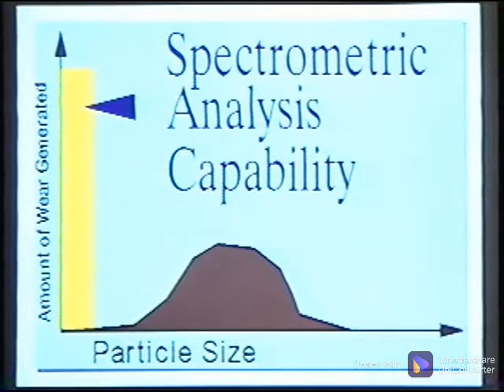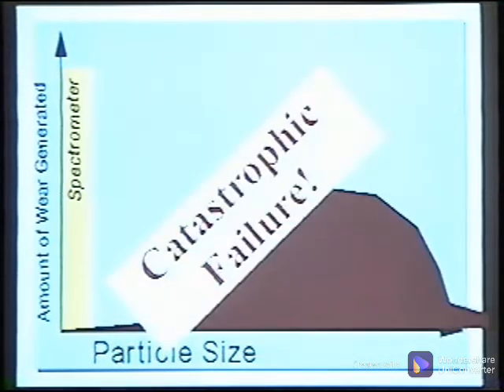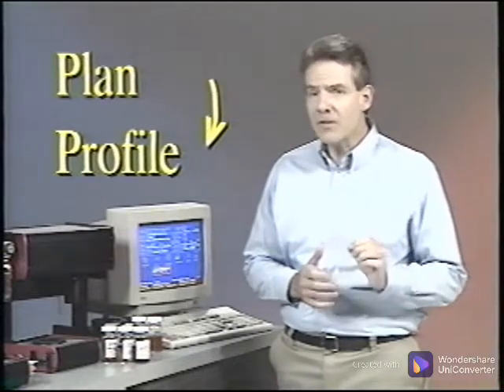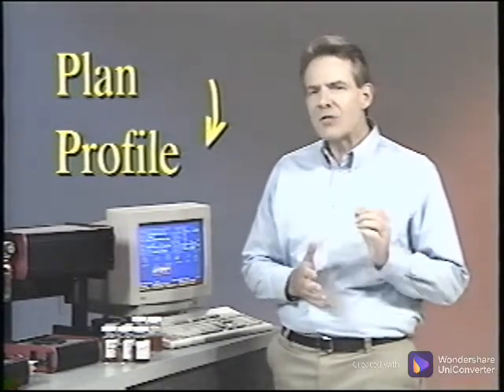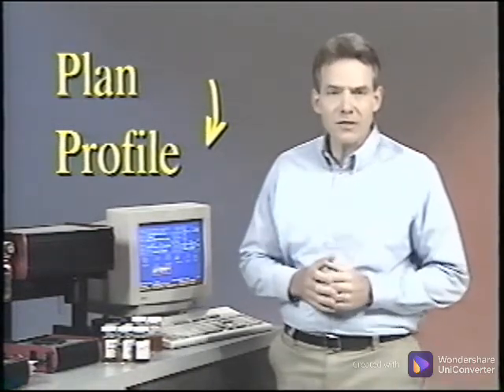Wear particles in the final stages can be in excess of hundreds of microns. Wear particles give the best indication of the severity, but may be overlooked with spectrometric oil analysis. This problem could have been avoided if a plan had been in place to test the oil based on the machine's needs or profile. A profile is a series of oil tests designed for machines with specific characteristics.